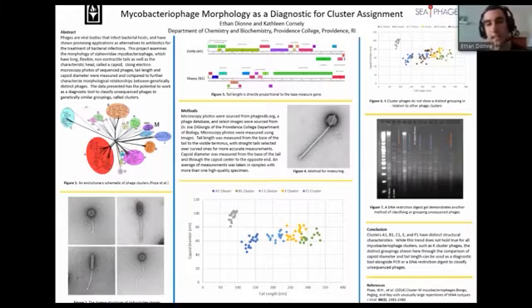For those who don't know, a DNA restriction digest gel, you basically expose phage DNA, which you've extracted from the phage, to an enzyme that breaks the DNA at certain sequences, which for our enzyme HA3 are common in phage. What this does is it breaks DNA from different phages into unique patterns in the gel that you can differentiate between. So we can determine that similar patterns must have similar DNA, and these similar DNA phages probably belong to the same cluster or the same subcluster.